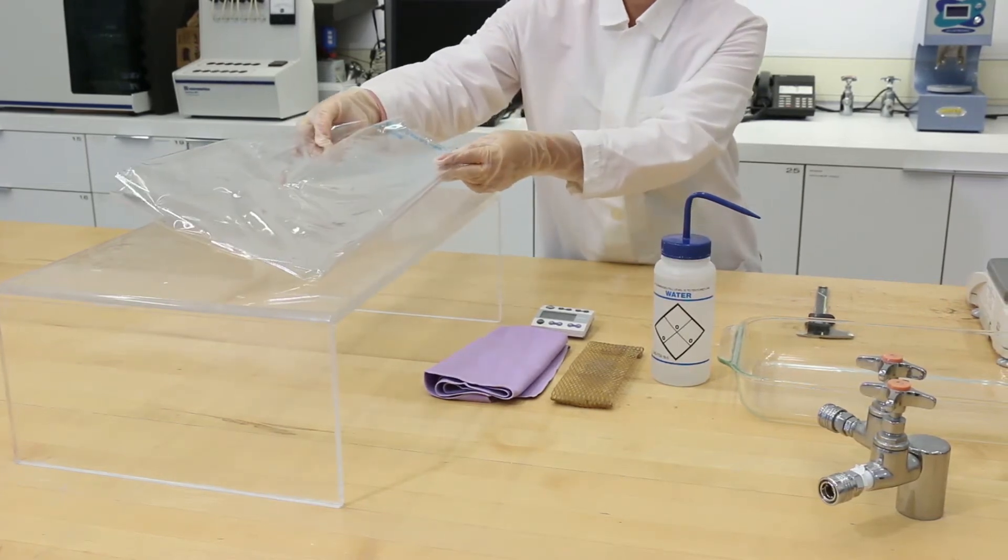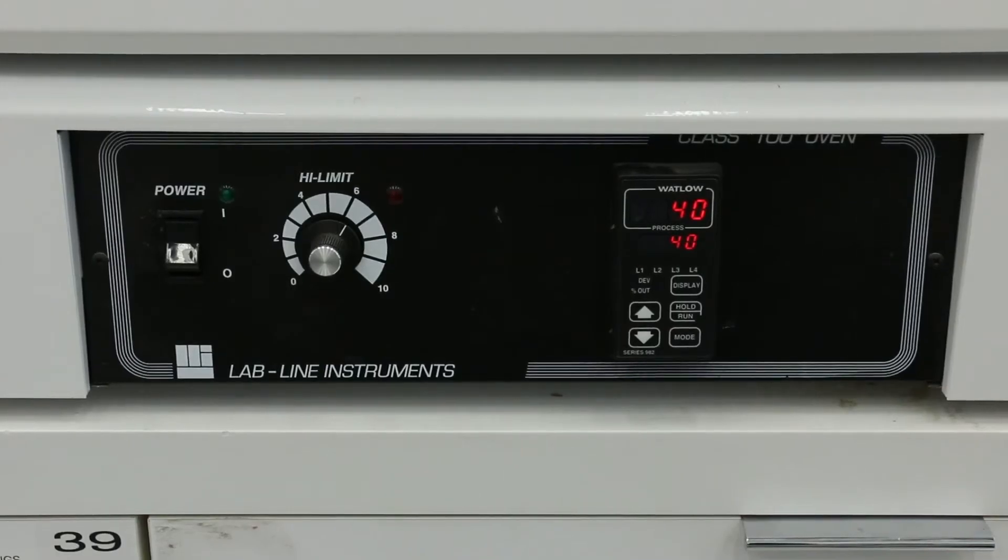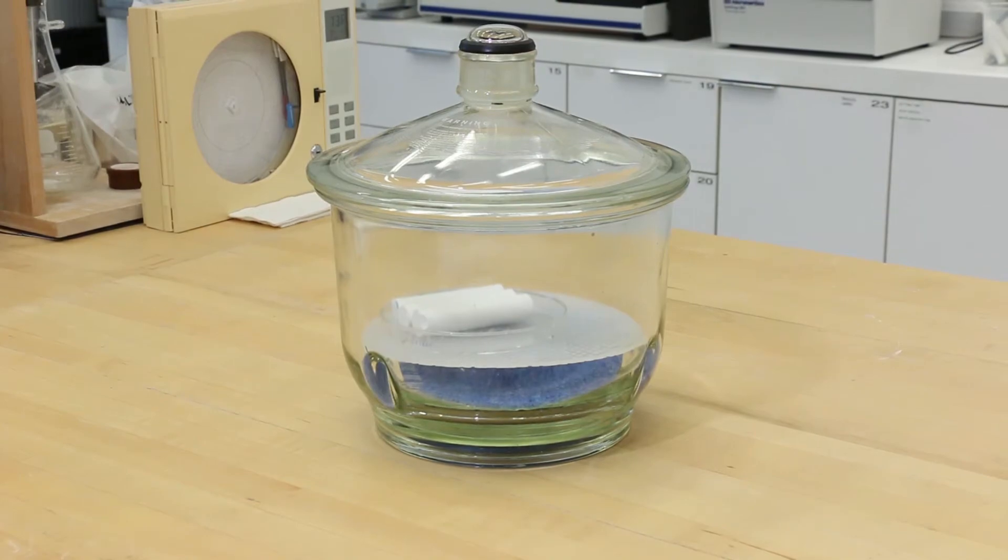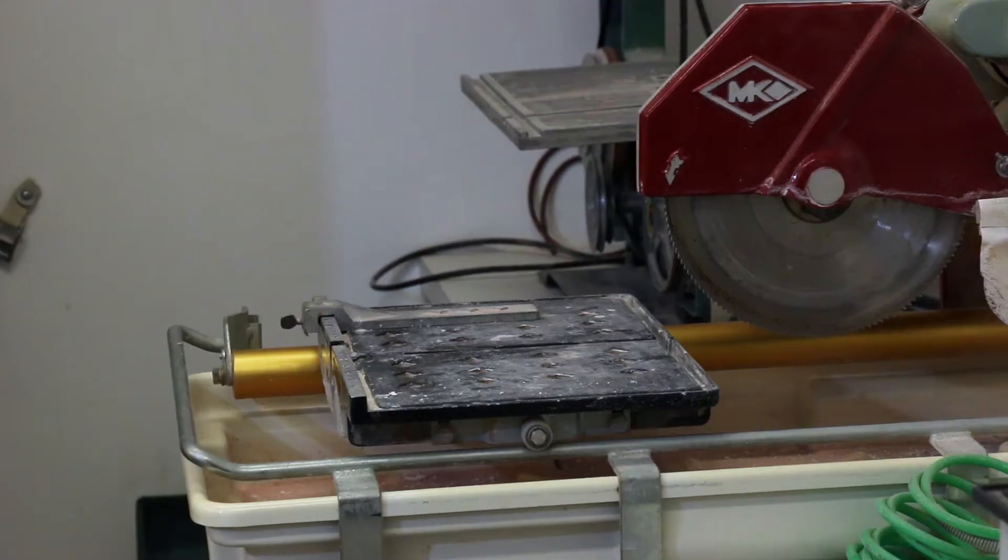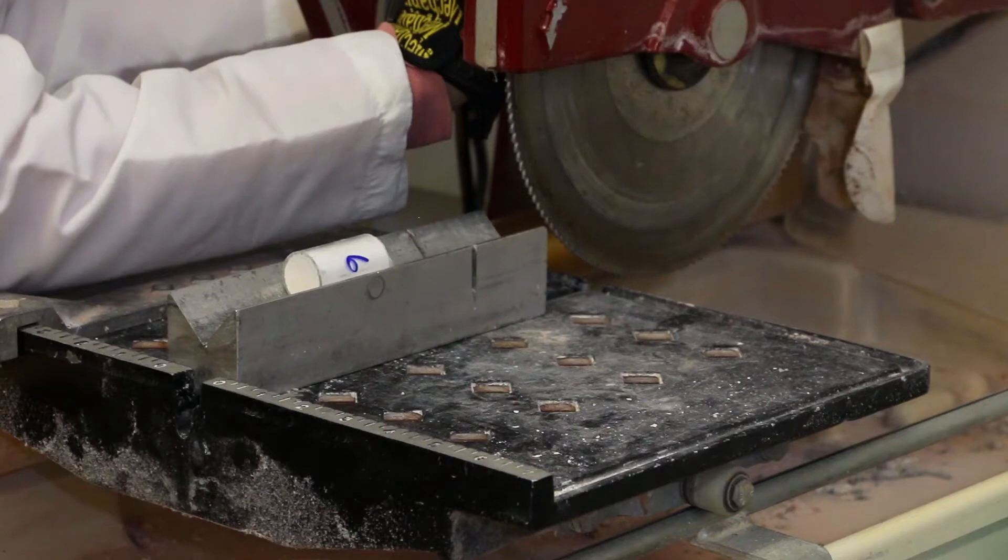4 mm plastic sheet to cover the open side of the plastic box, an oven, desiccator and desiccant, a tile saw, and a v-shaped specimen holder for cutting.